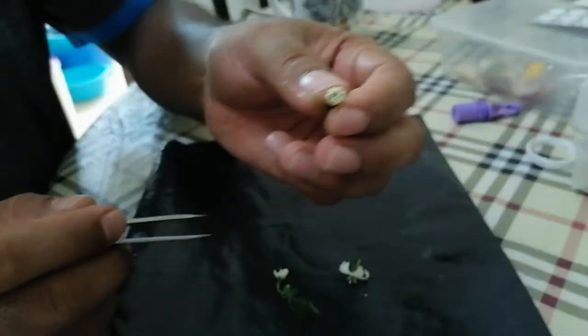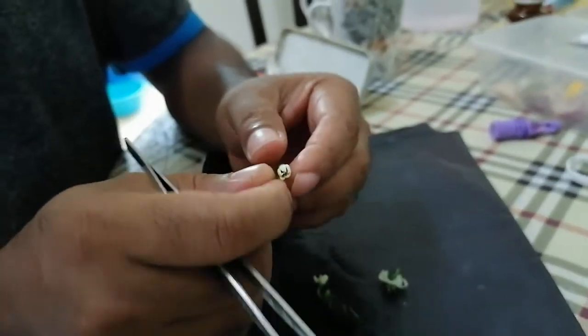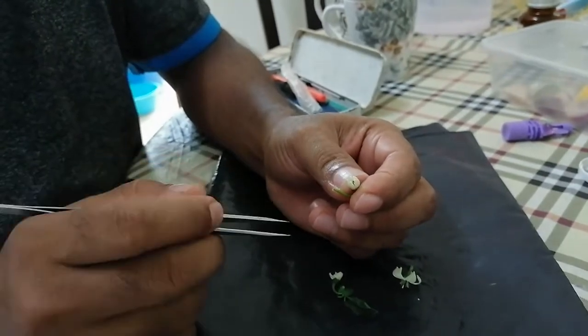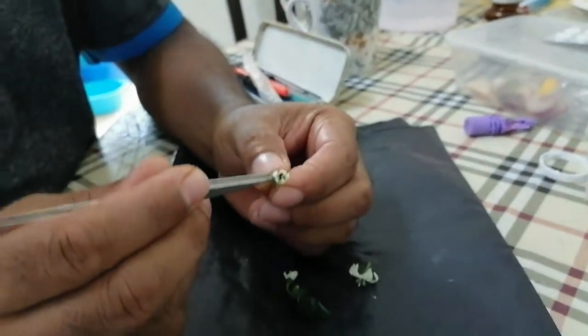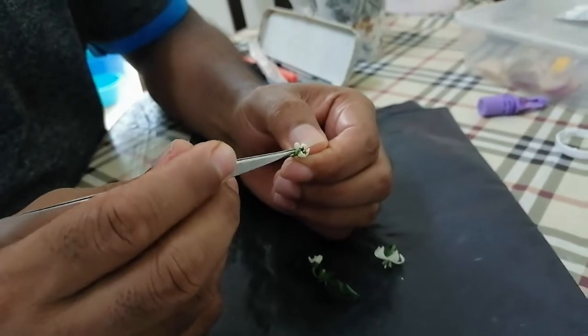This is chili flower. Chili is a bisexual flower — they have male and female in the same flower. I want to show you the different parts. This is an open one that I have plucked from the plant, about to bloom.